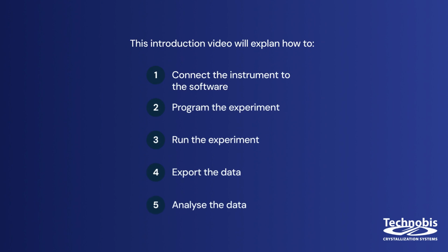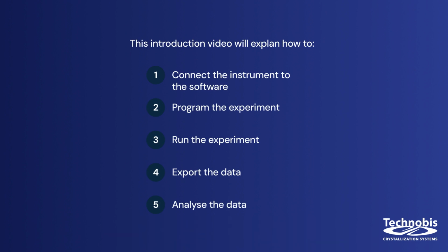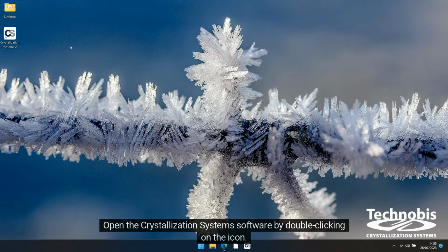Hi there. In this video, we will explain the 5 steps of using the Crystallization Systems software to run an experiment with the Crystalline instrument. Open the Crystallization Systems software by double-clicking on the icon.